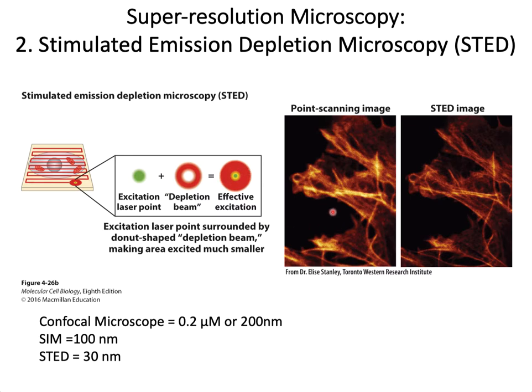So you can see the comparison on the right of a point scanning confocal image with a STED image, which can push the resolution to the 30 nanometer range.